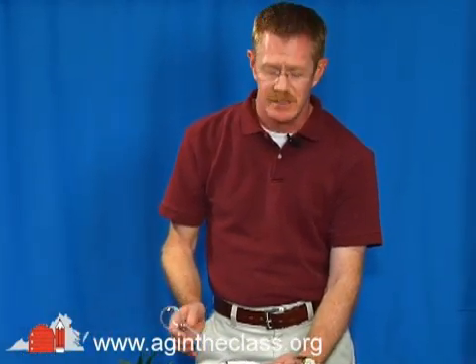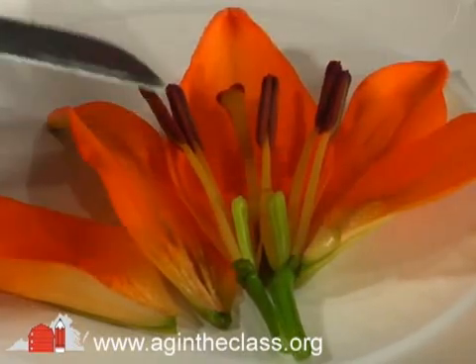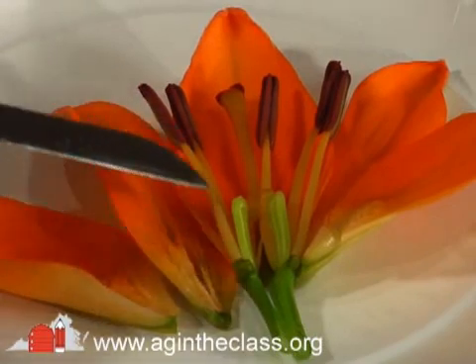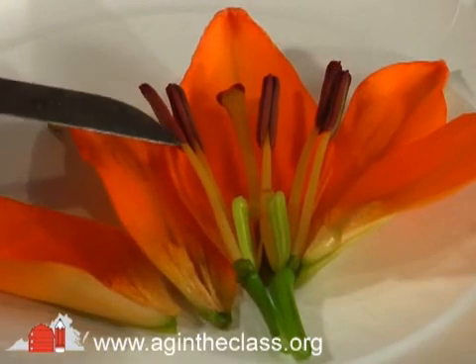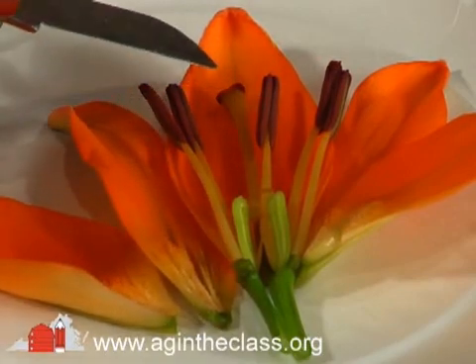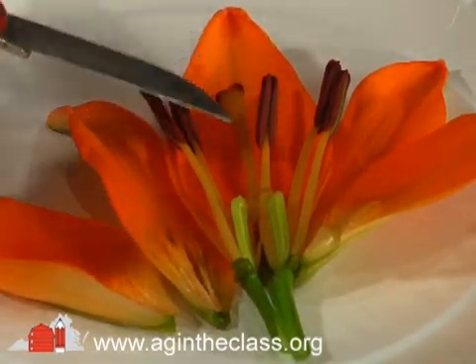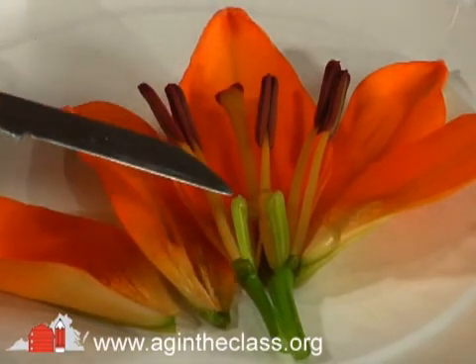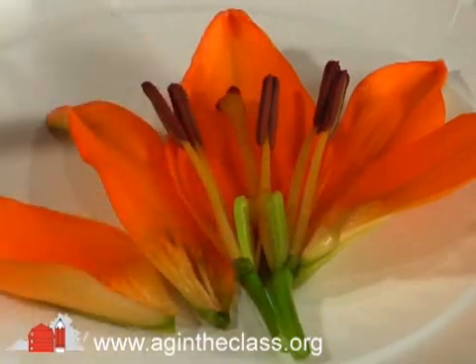I recommend using some type of hand lens magnifying glass so you can look up very closely. With our flower cut open, now you can see all of the flower parts — let's just review those. We have the petals, which are the orange parts on the outside. We have the stamens, each of which includes an anther and a filament. Then we have the pistil that runs down the center of the flower, which includes the stigma at the top, the style, and then the ovary at the bottom, which includes the ovules. These all together make up the parts of the flower.